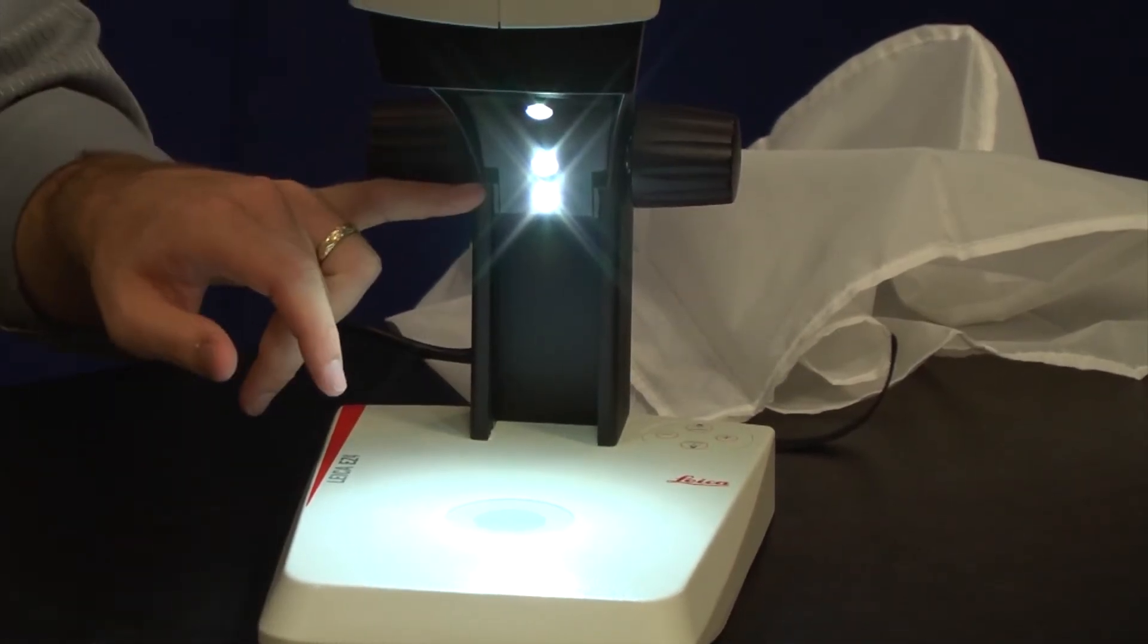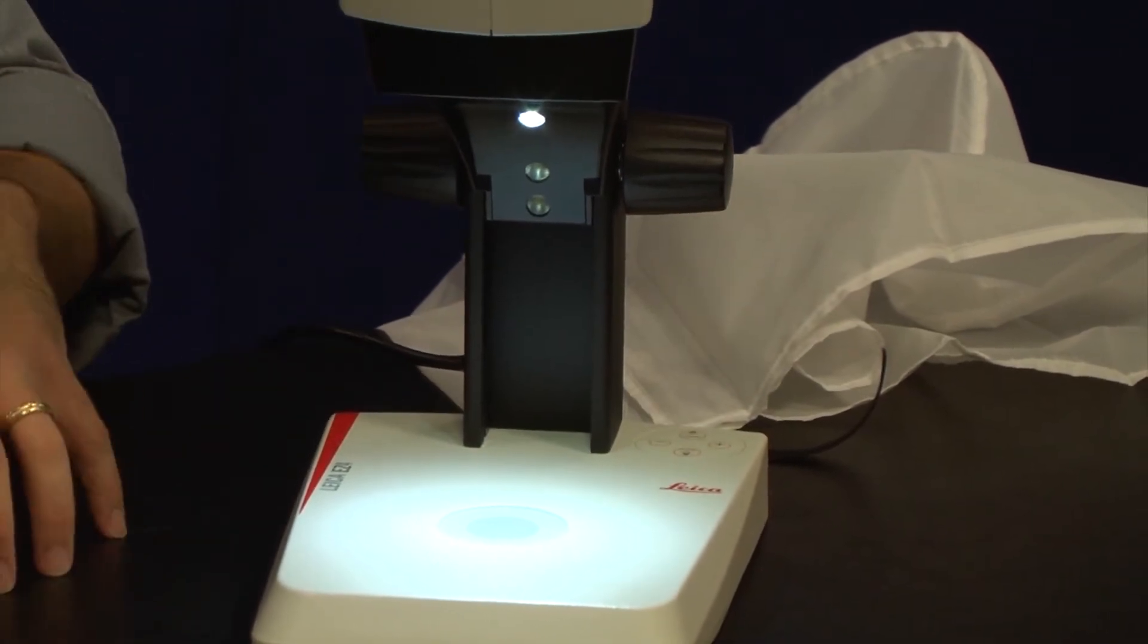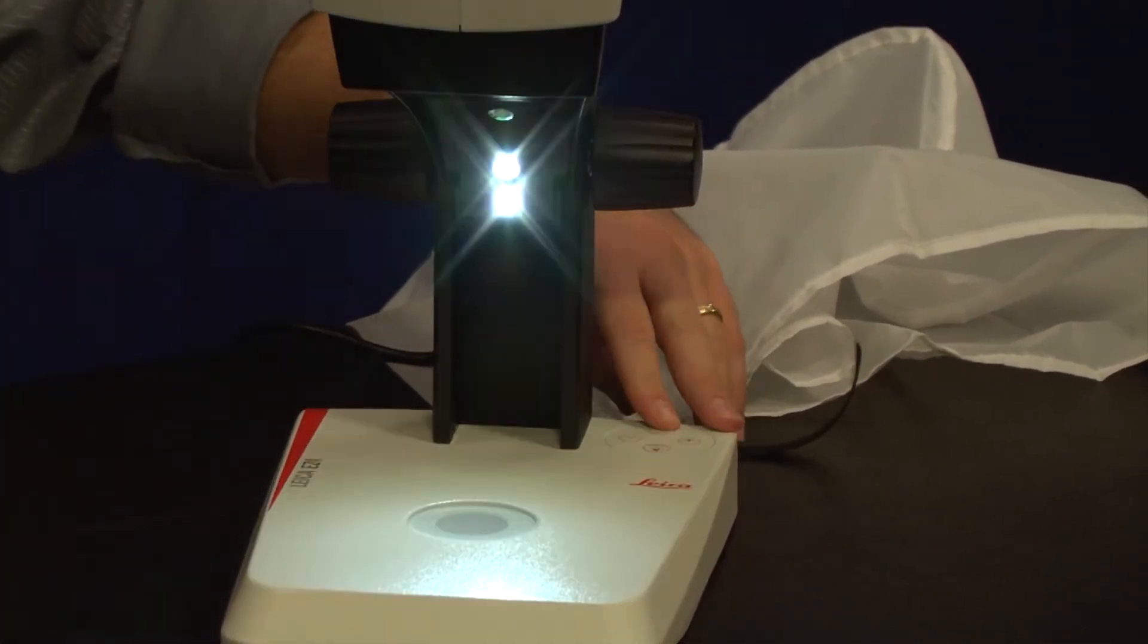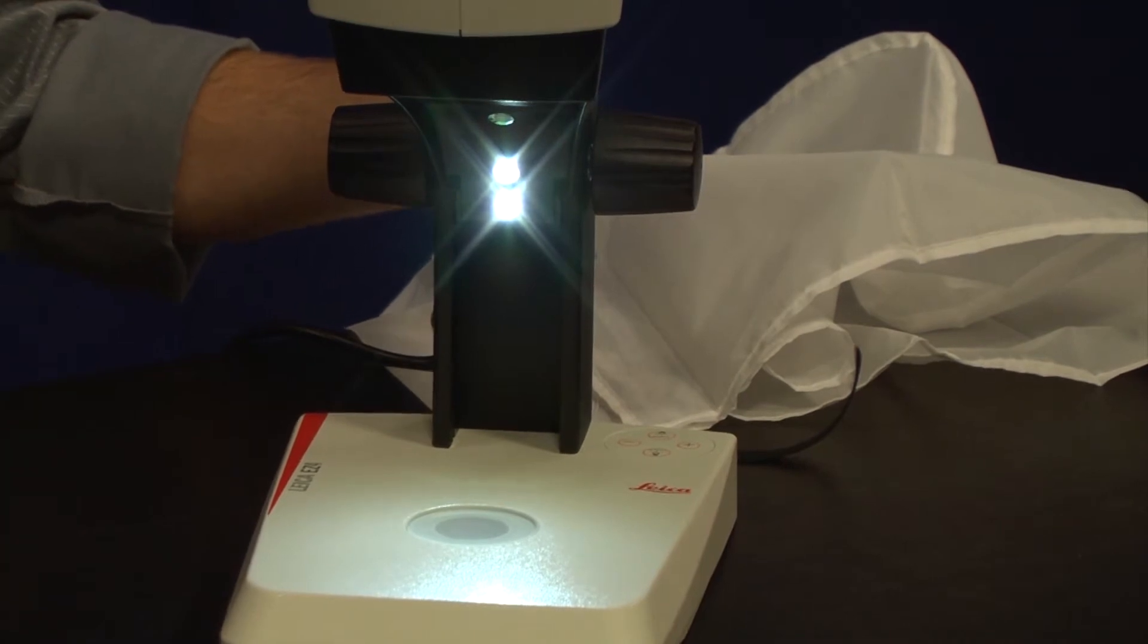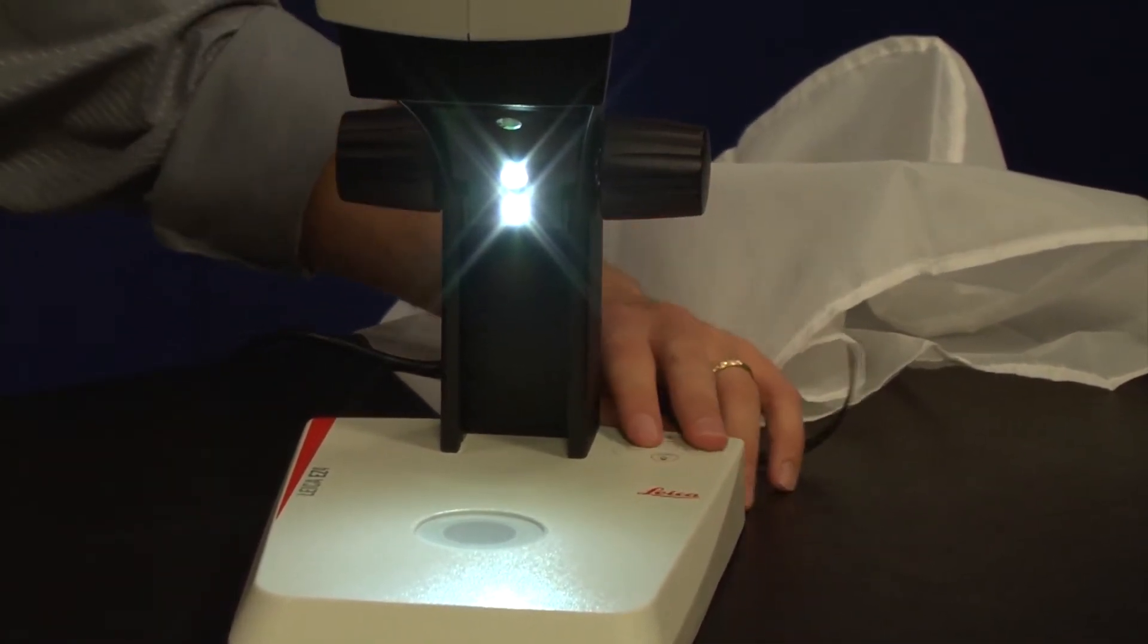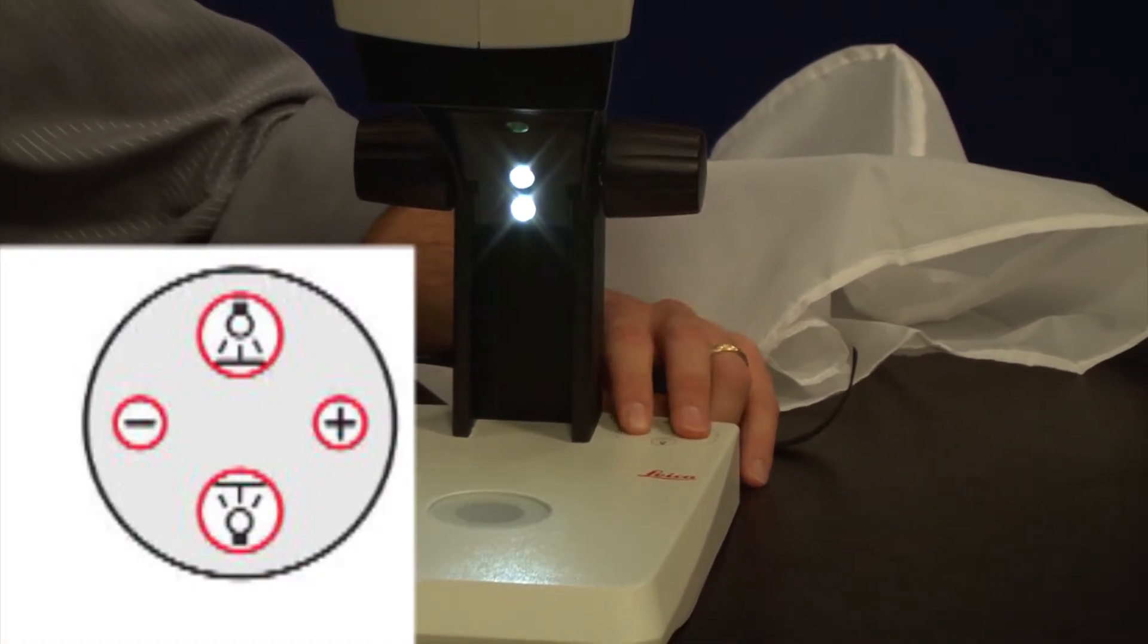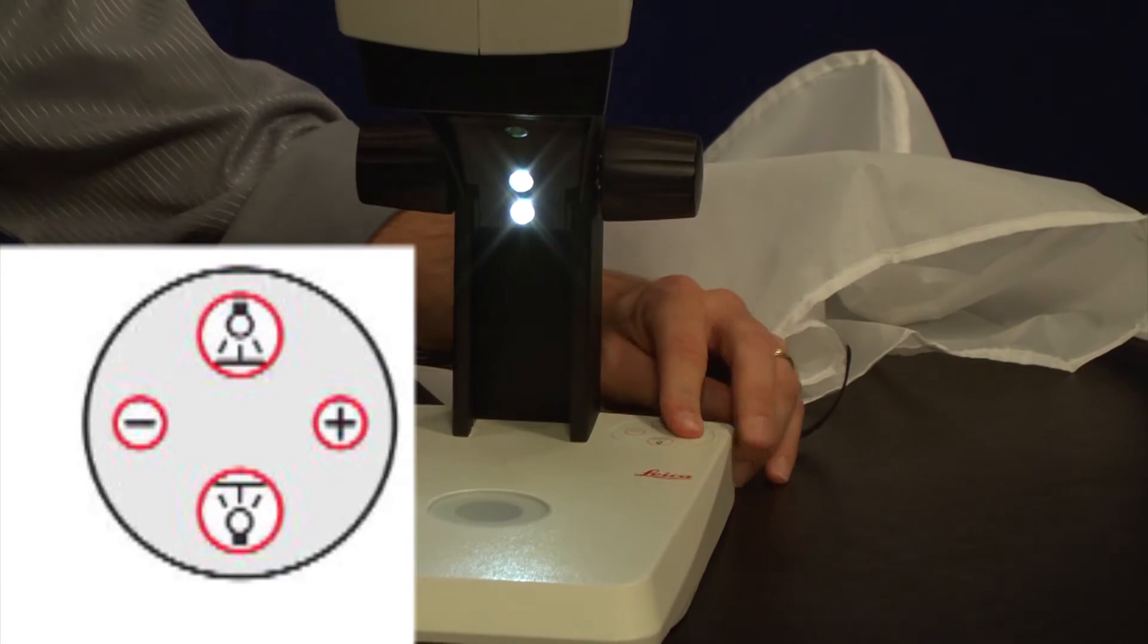So three options with the reflected light. We can have all five LEDs on, the top three on with light from straight down, or the back two on with light coming in from the back casting shadows. Just as before with the transmitted light, we have intensity control so we can turn the light down or turn the light up using the plus and minus buttons on the control panel.